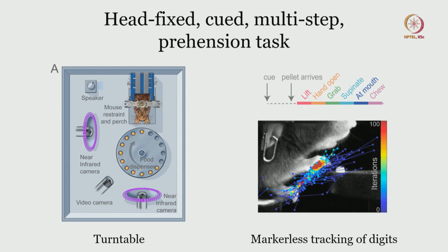Now let us look at another task, which is a very advanced way of looking at it. Advanced in the sense that here the head is fixed.